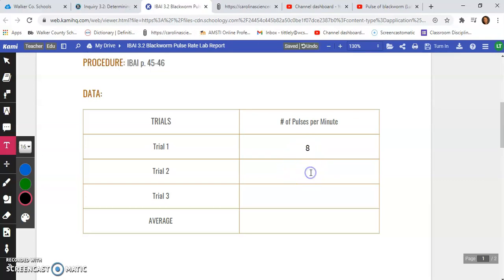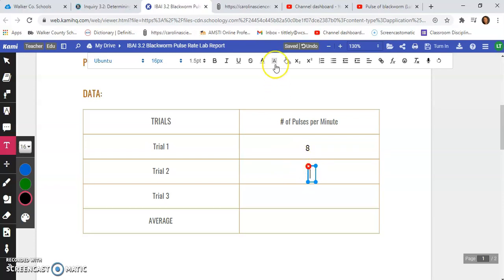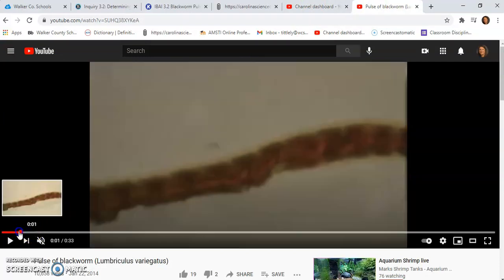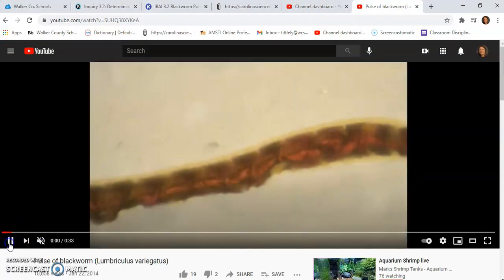Okay. So now we're ready to do trial 2. So let's go back to our video. And remember, we're keeping our eye just on one segment of the blackworm's body, and go. So let's see.